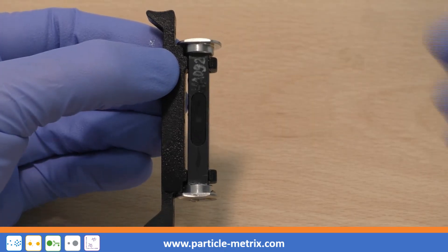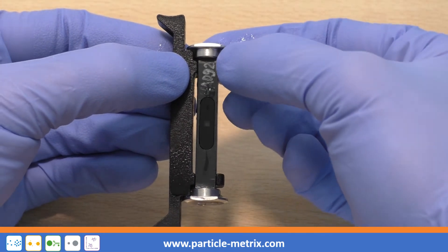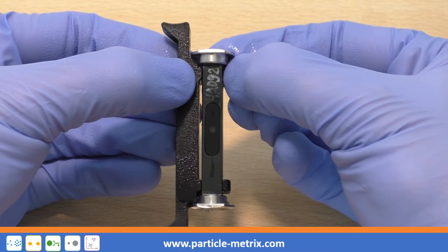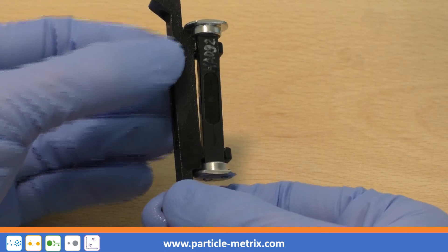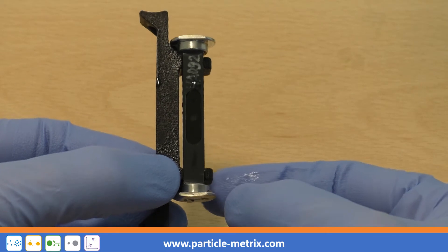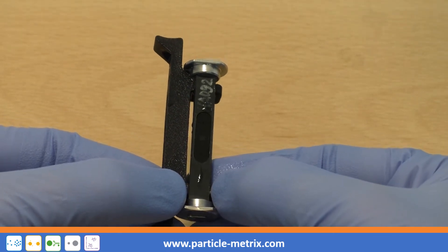To detach the cell, open the upper bracket slightly by using the thumb of your right hand. Push the top part of the cell slightly and carefully out of the bracket by using your forefinger. Repeat the procedure with the lower bracket of the cell carrier.